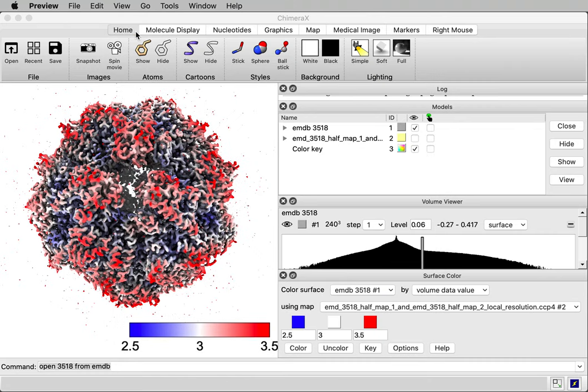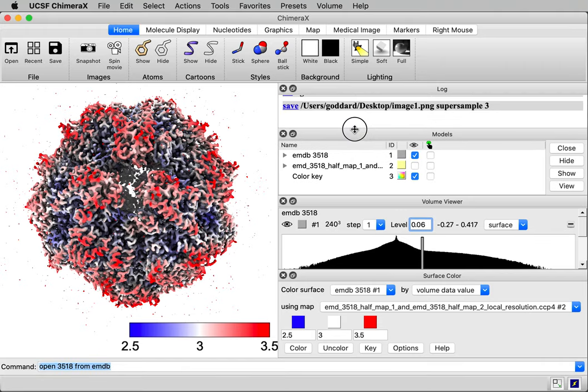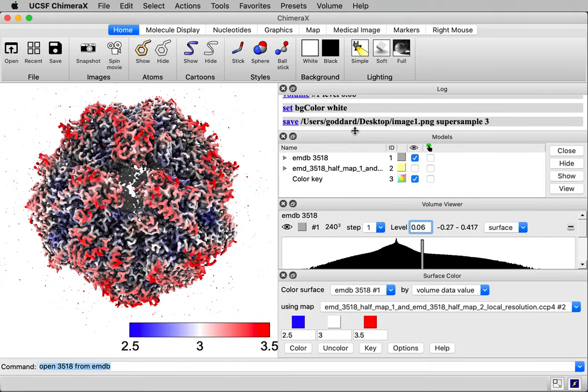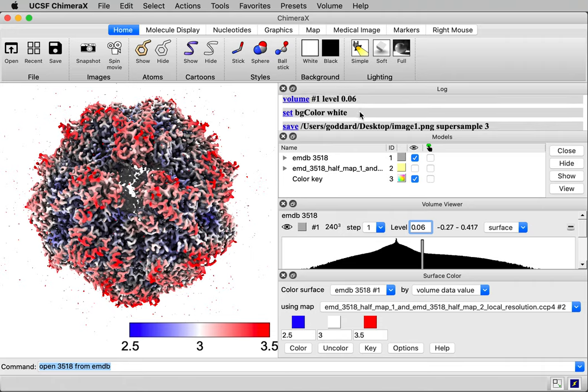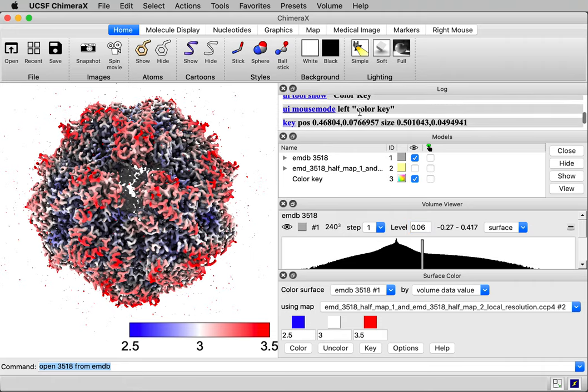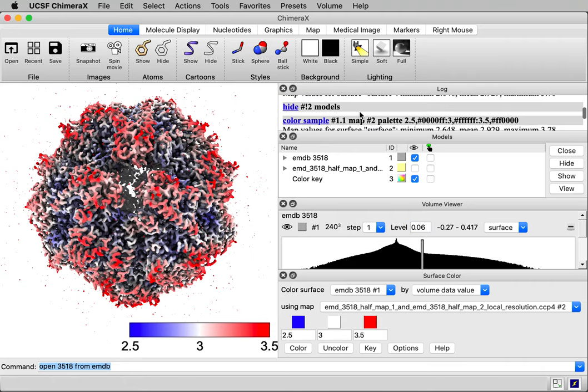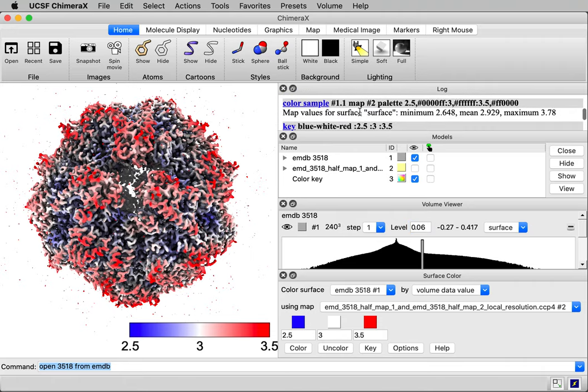So if you do not have the Surface Color panel, you can still do this in ChimeraX 1.1, which is older, using the equivalent command. And the panel, when I press the color button, it logged the command, the equivalent command. Here it is. It says color sample.